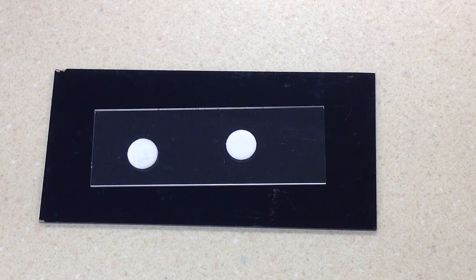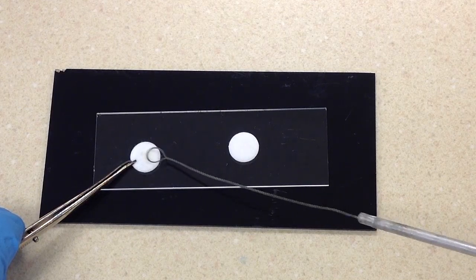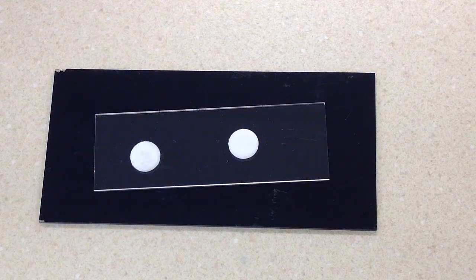Now it's time to inoculate our disks. The procedure calls for us to use colonies that are 18 to 24 hours old. I'm going to scoop up two or three isolated colonies and go ahead and smear that on the disk. That's our positive control and we're going to be using Group A Strep. Now for the negative control, I'm going to use Group B Strep, Streptococcus agalactiae.